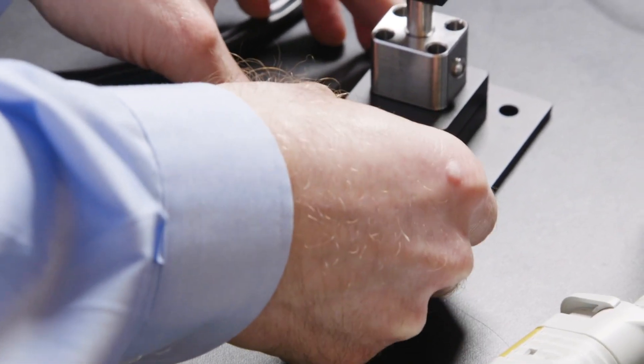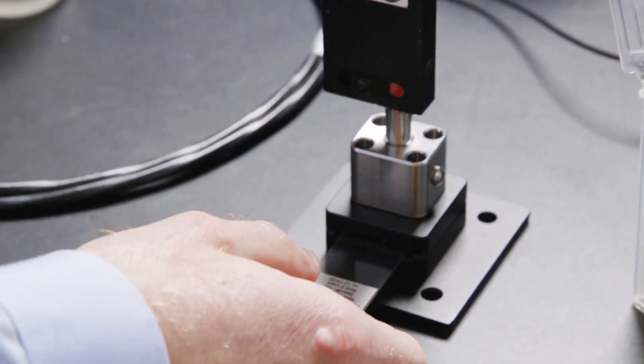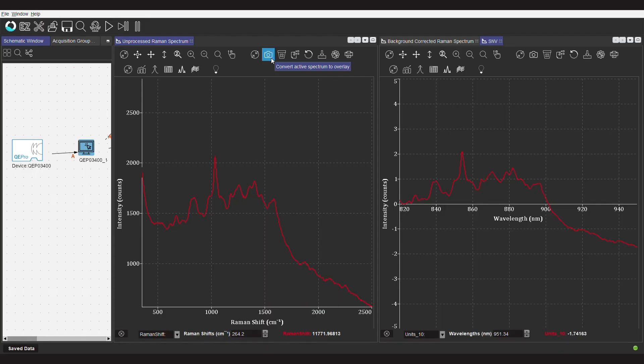We're going to stick that right into the holder. We're going to see some emissions here. If we click on this camera icon, it's going to freeze that in place. So we know what this looks like now — what to expect without our analyte present.